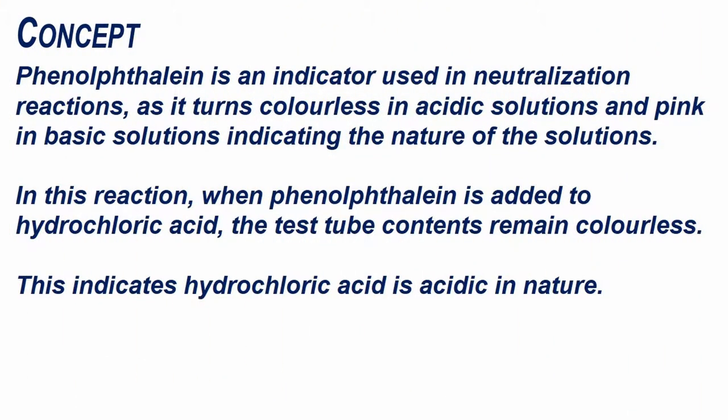Phenolphthalein is an indicator used in neutralization reactions as it turns colorless in acidic solutions and pink in basic solutions. In this reaction, when phenolphthalein is added to hydrochloric acid, the test tube contents remain colorless. This indicates hydrochloric acid is acidic in nature.